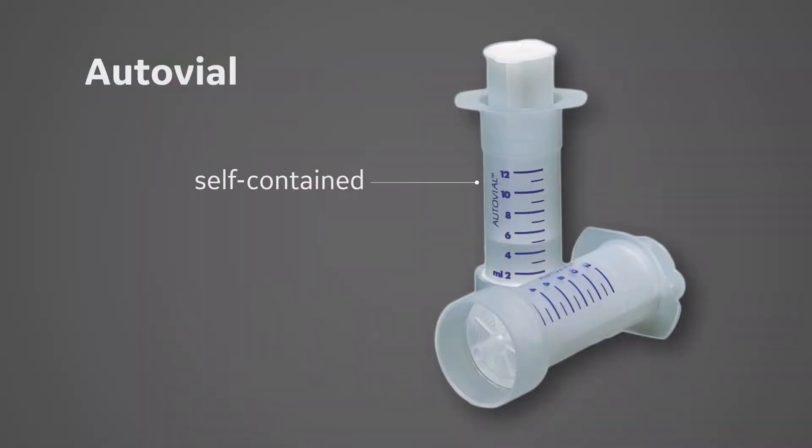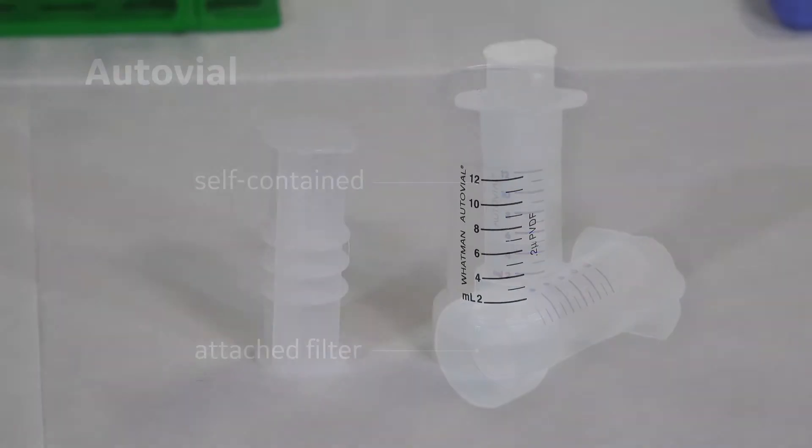Now let's switch to the autovial. The autovial is one self-contained unit with the syringe filter attached to the base. A single unit for ease of ordering that even comes with a handy barrel stand for convenience.